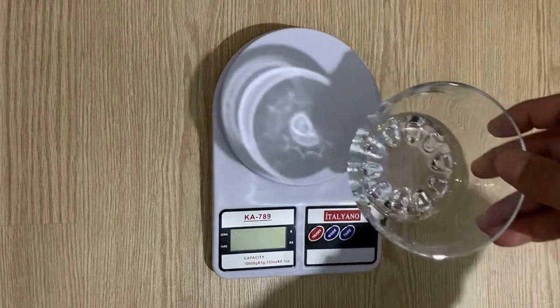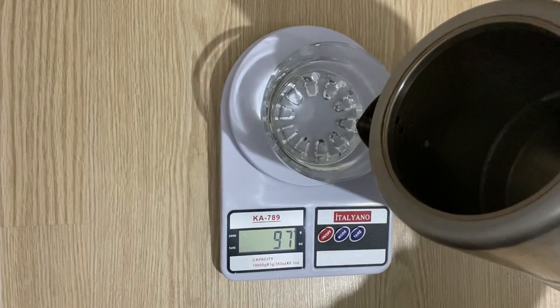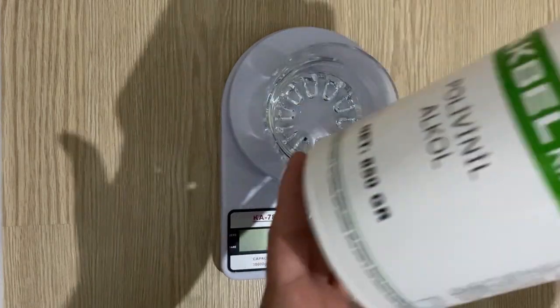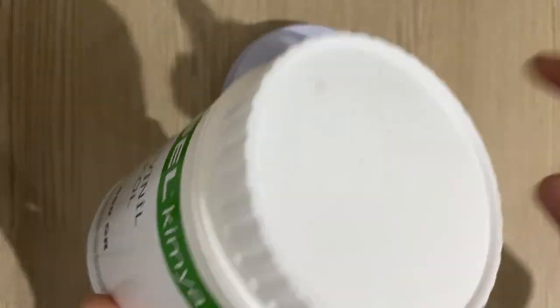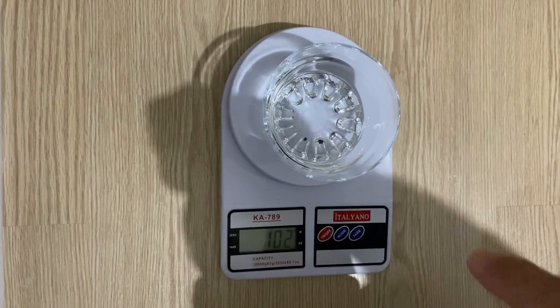First of all, I'm going to use a glass bowl. I am going to add 100 grams of deionized water — it is hot water, almost boiling. And I'm going to use polyvinyl alcohol powder. I will add 10 grams of polyvinyl alcohol powder into the hot water.